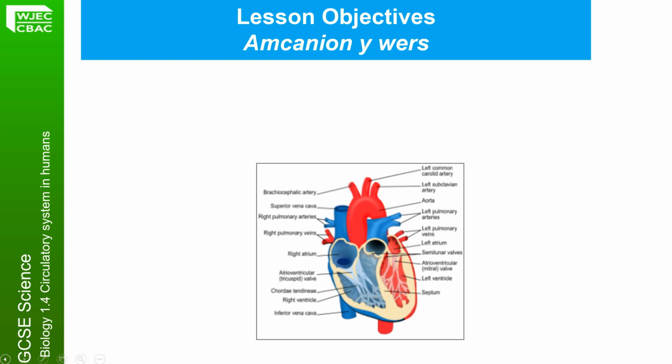However, if you do wish to dissect a heart at home, we do have some videos to show you exactly how to do that and me to talk you through it, as well as a video of a scientist dissecting an ox's heart for you, which is particularly large, and it will enable you to see exactly what you would see in a demonstration in school.